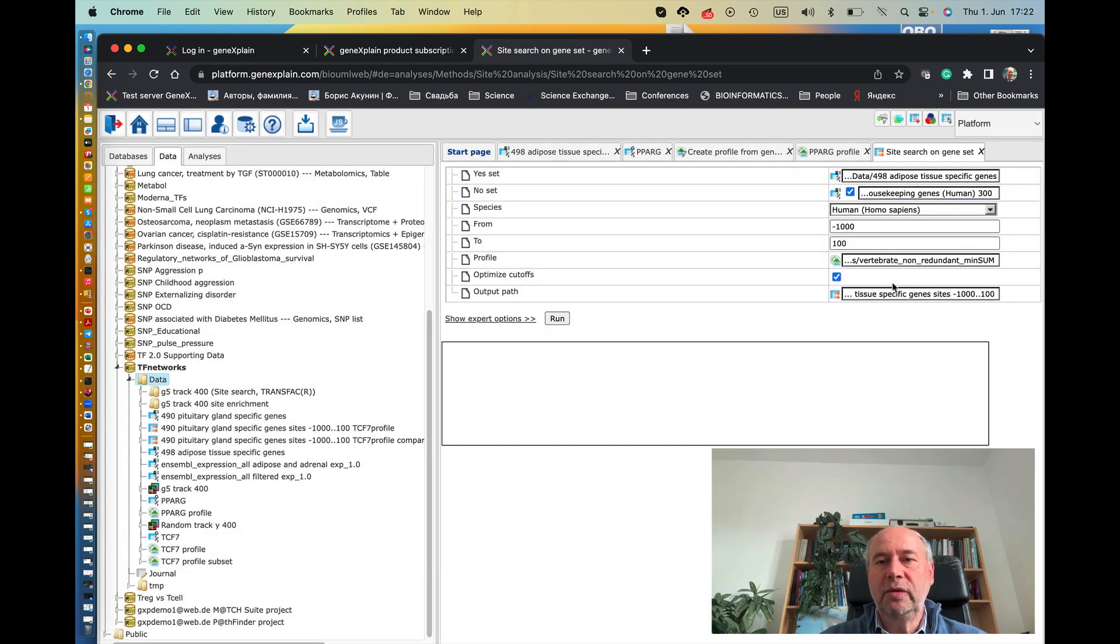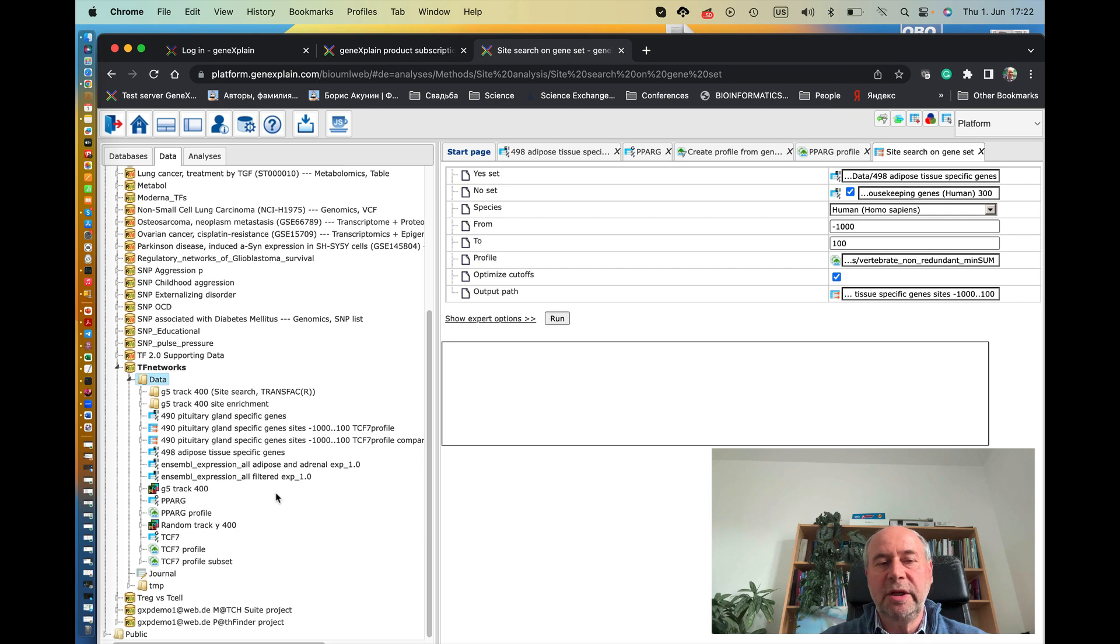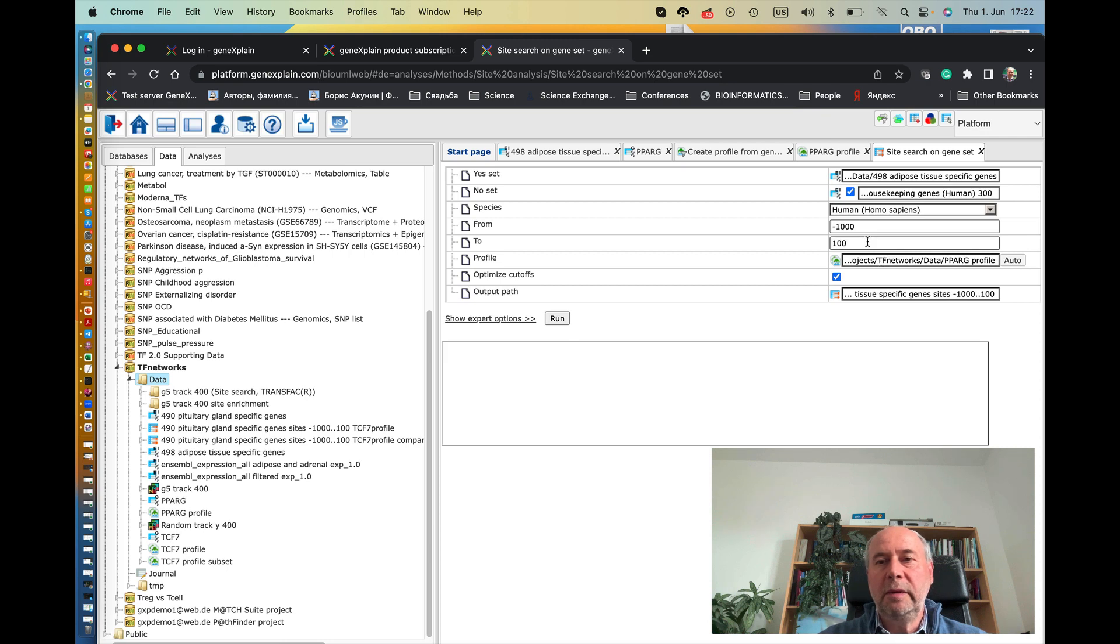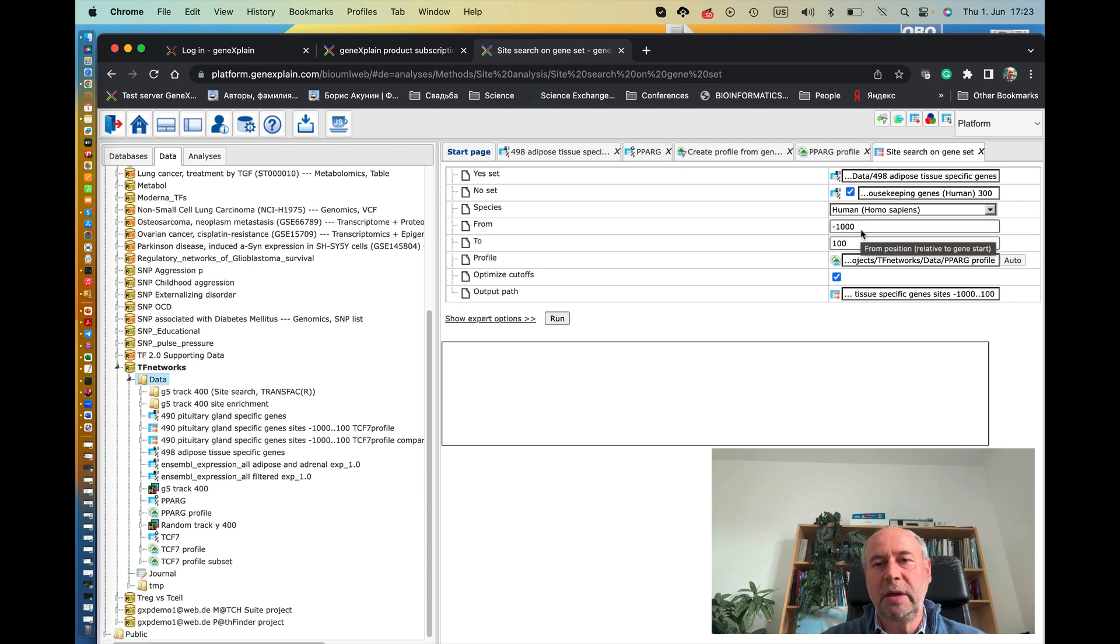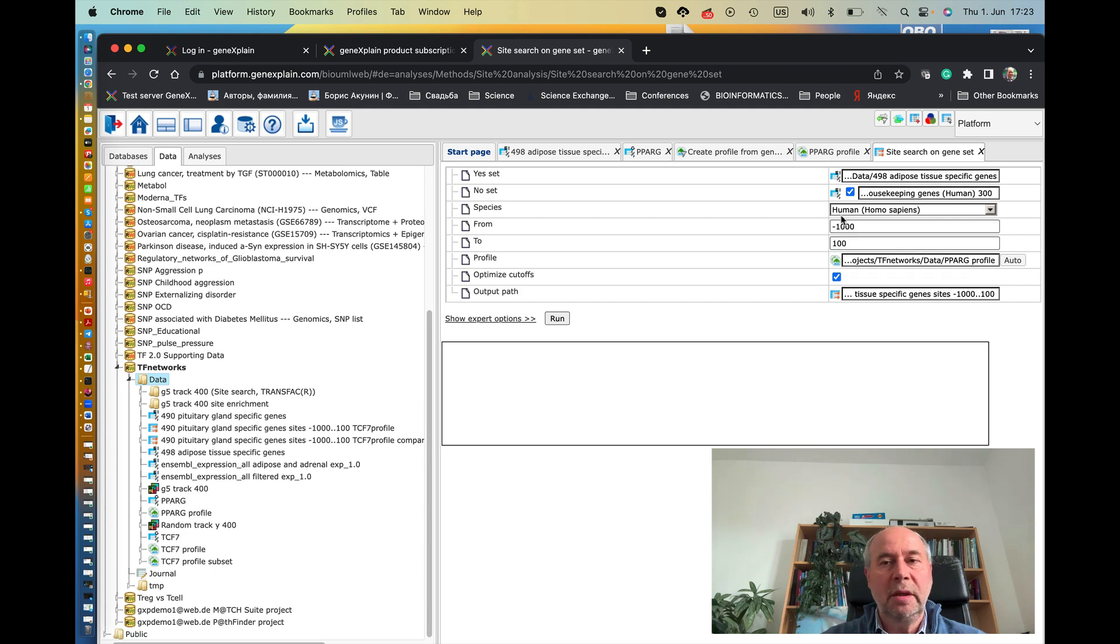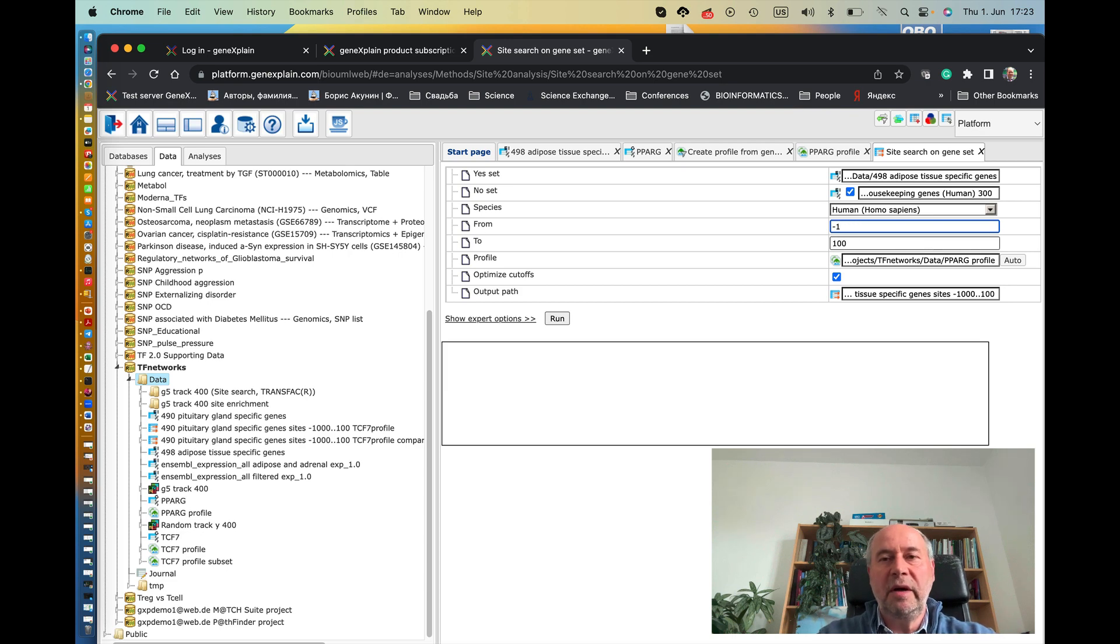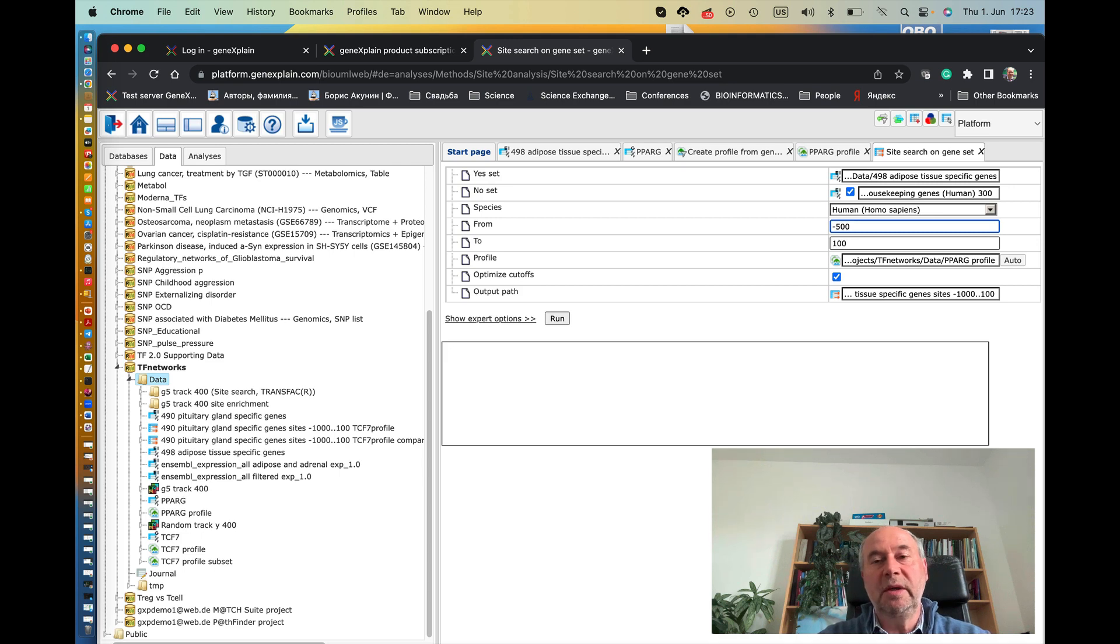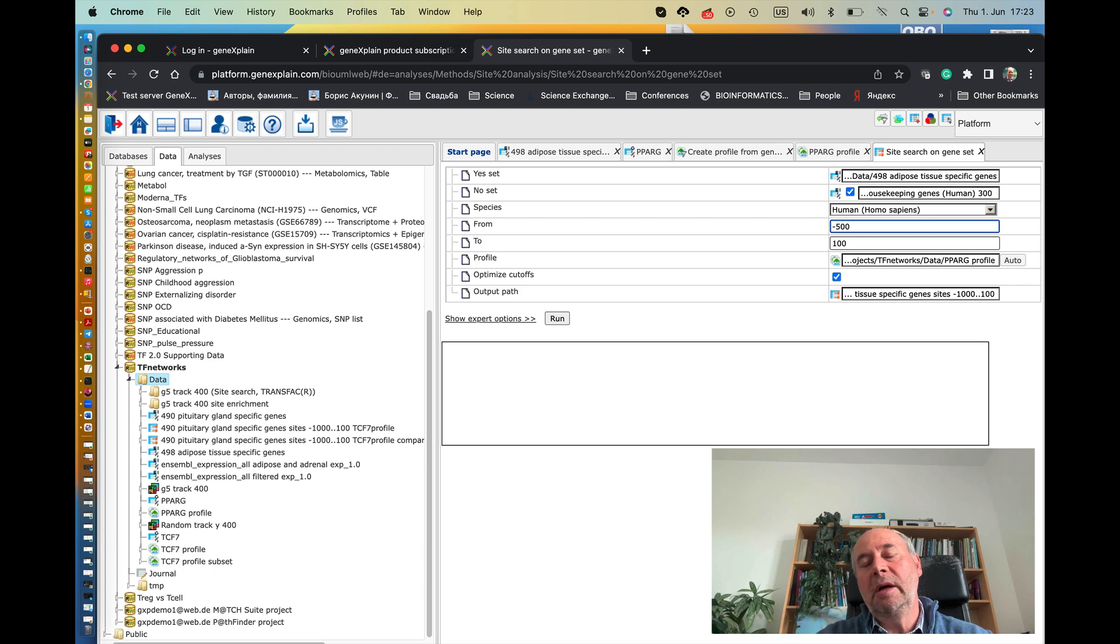And now we have to put here the profile, the newly created profile for our transcription factor PPAR gamma. So we drag and drop this profile here. And we have to specify the promoter length, which is minus 1 kb from start of transcription to 100 nucleotides downstream from start of transcription. You can change this to a smaller size, for instance 500, to see only those very particular genes which are indeed regulated by PPAR gamma in very proximal positions in relation to start of transcription.